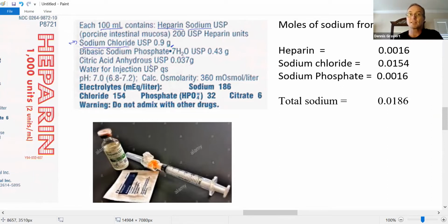This is changing the pH. We're going to pH balance this. So we have this basic compound with sodium in it. And then we have an acid, and the combination of the acid and base is going to adjust the pH to where we need it. 7.0, make it neutral. And then there's a tolerance range here. So these two components are there to adjust the pH.